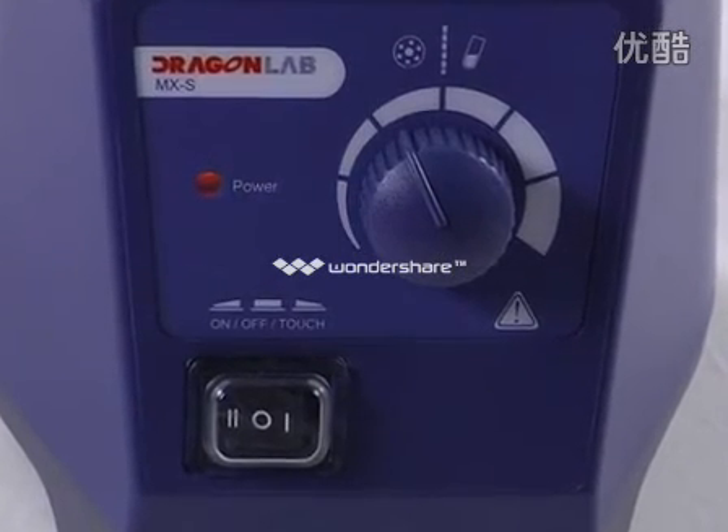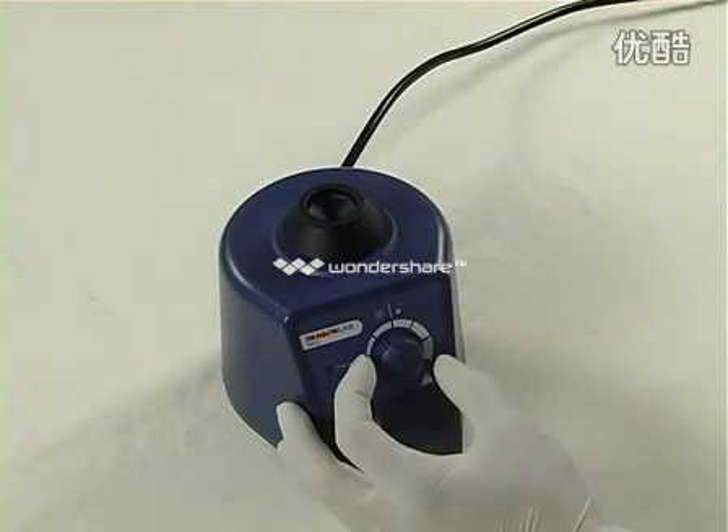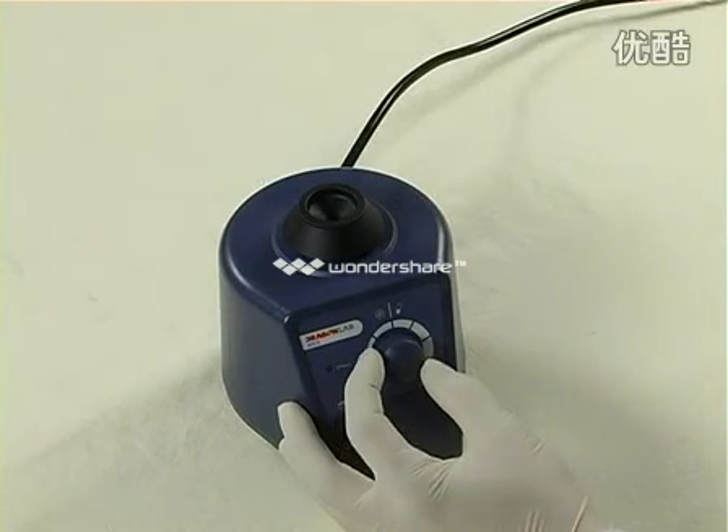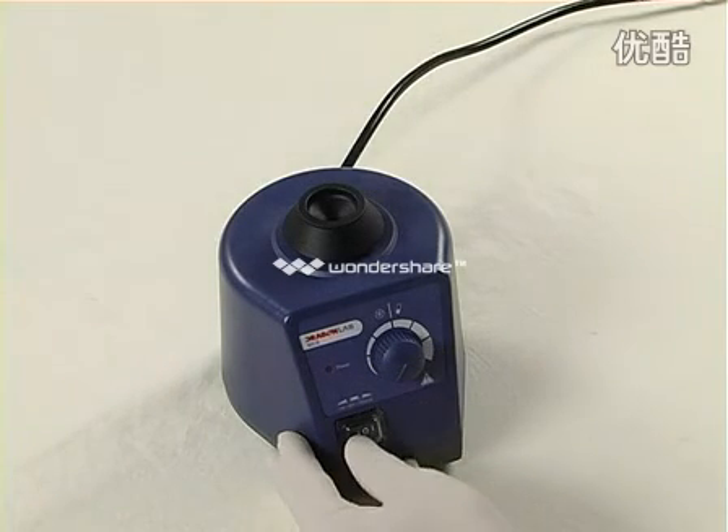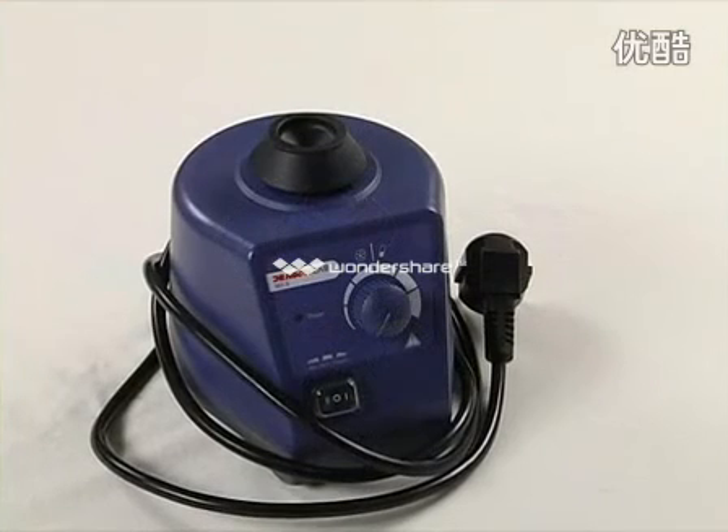The power LED will illuminate during operation. When the work is over, push the two-position switch to the left off position to turn off the instrument.